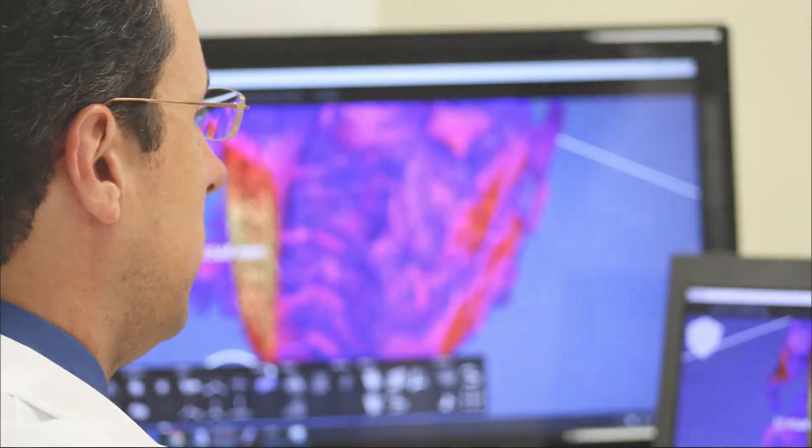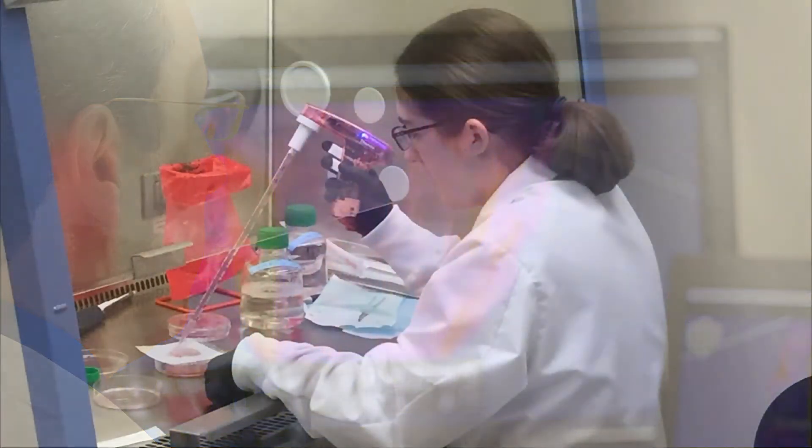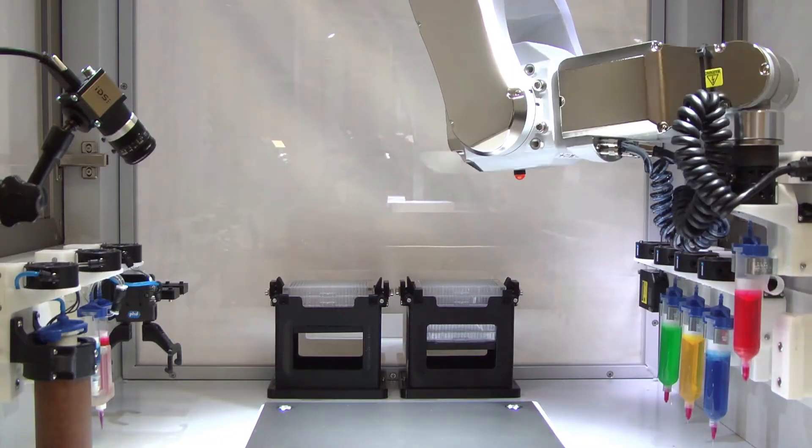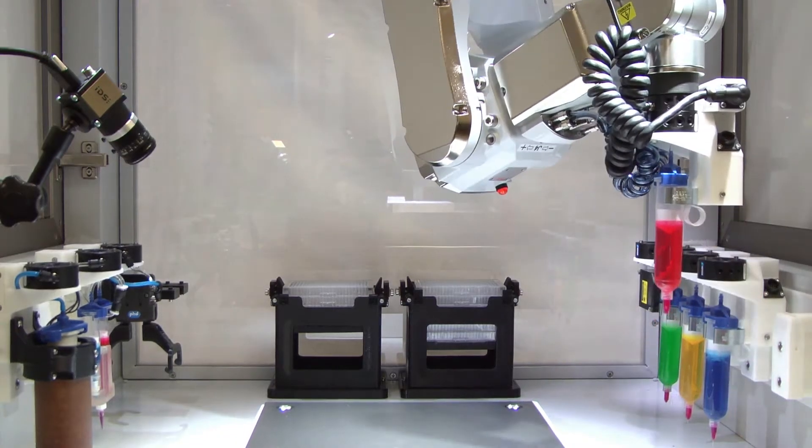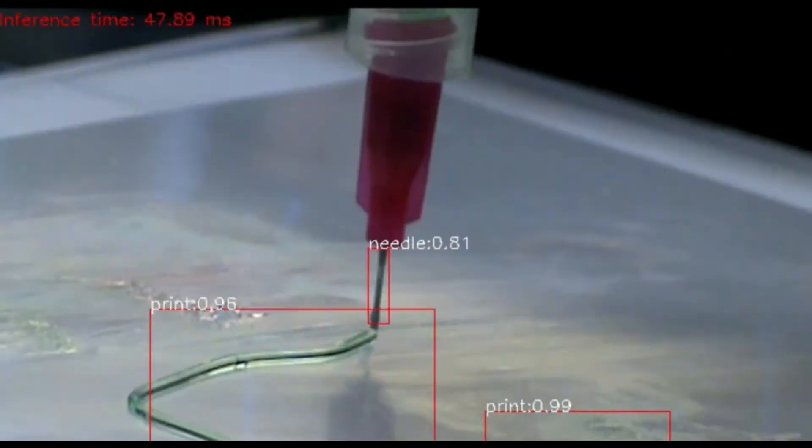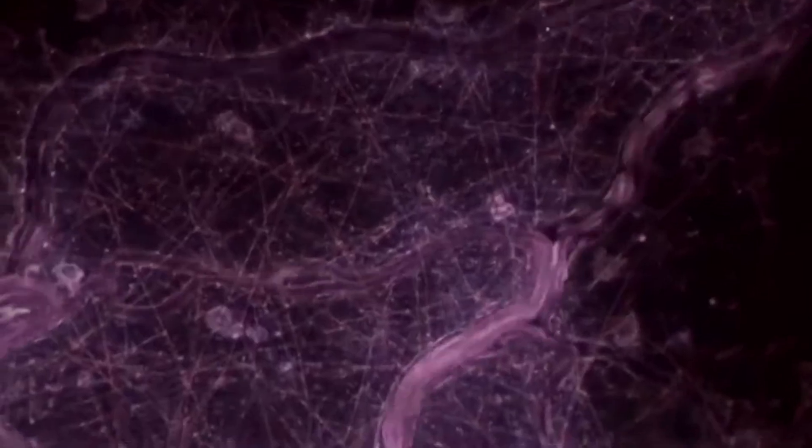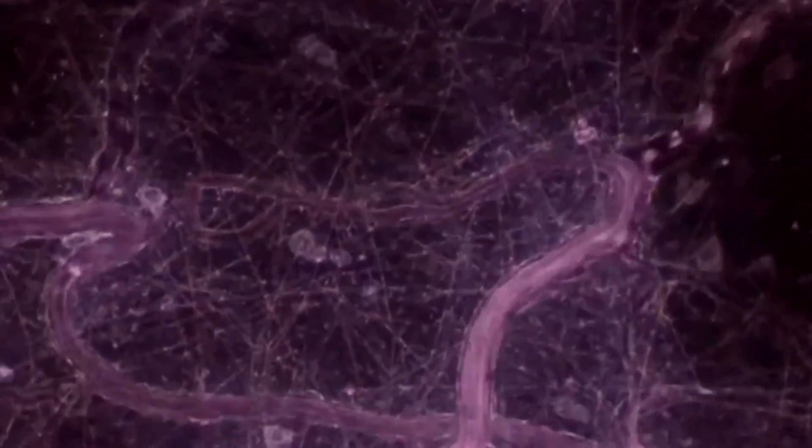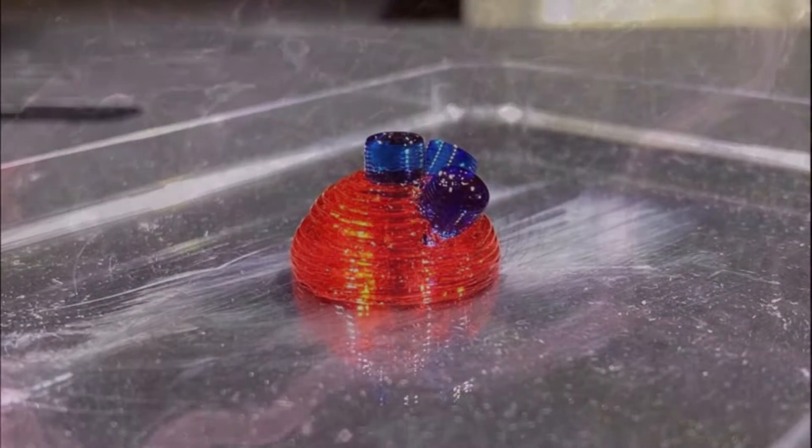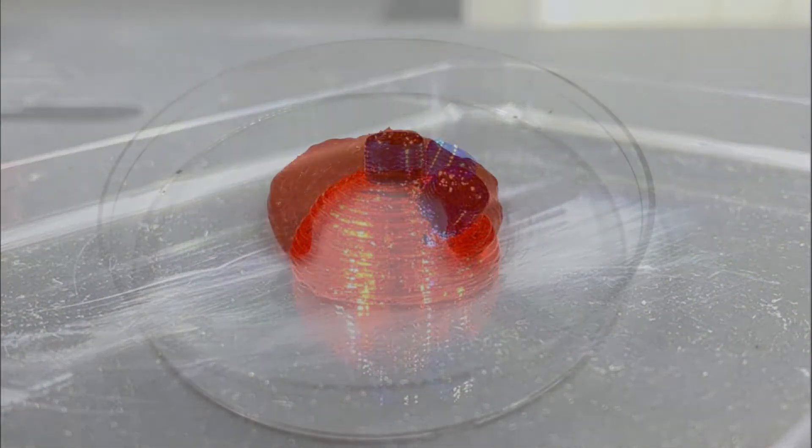The team of professionals at Advanced Solutions Life Sciences are utilizing the newest technologies in robotics, vision systems, artificial intelligence, and vascular biology to enable clients to easily and repeatably build personalized 3D human tissue models.